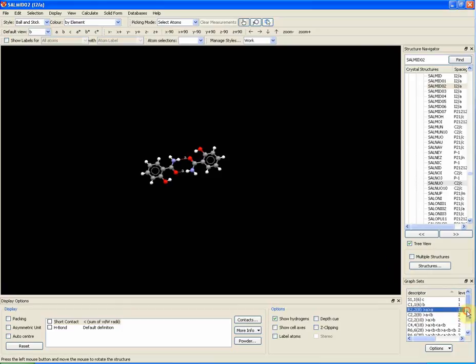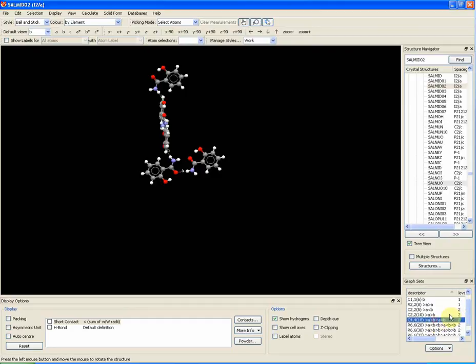Another example is the 4-atom chain we can see, represented by the C4 in the graph set box.